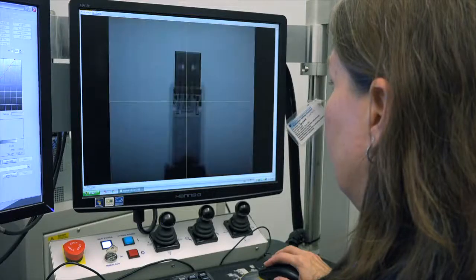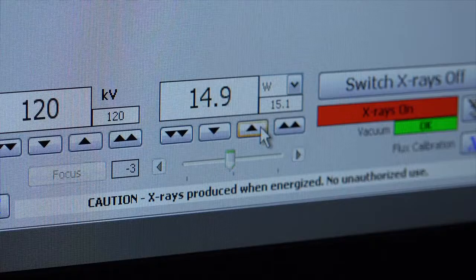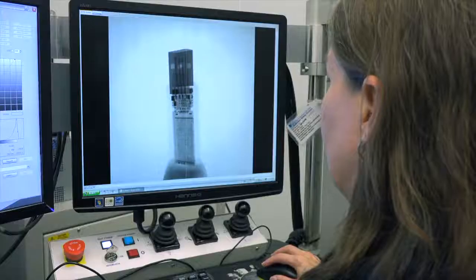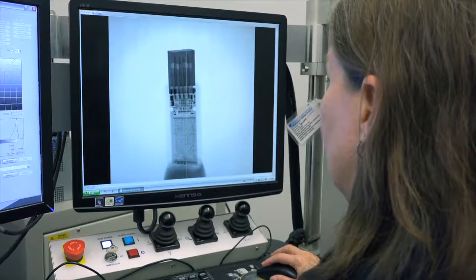Once we have a sample positioned on the stage, we can go into the software to adjust the x-ray energy, the exposure time, and the sensitivity of the signal to get the best image possible. Thank you for joining me for this video on the basics of MicroCT imaging.